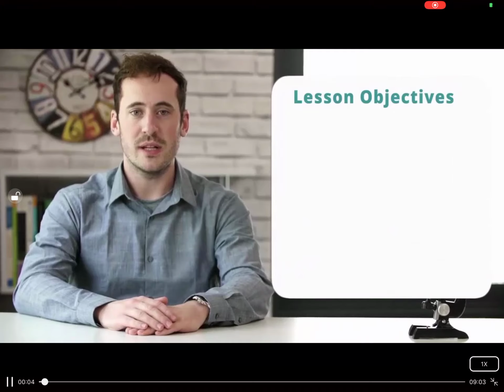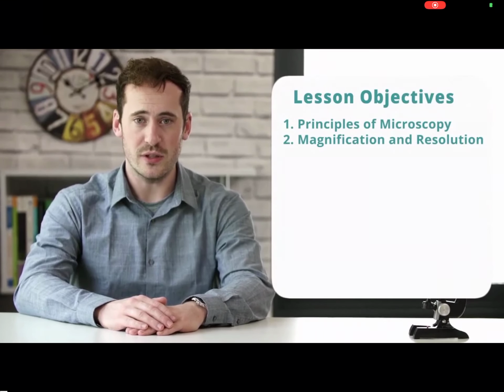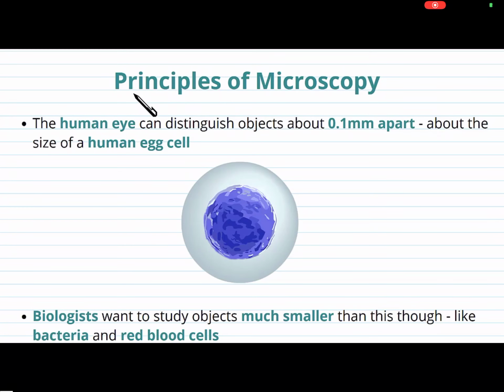Hi guys, in this video we'll be looking at the principles of microscopy, magnification and resolution, the light microscope, laser scanning microscopes, and then we'll finish with a summary. So we need to understand how microscopy actually works before we delve into how the microscopes work as machines.